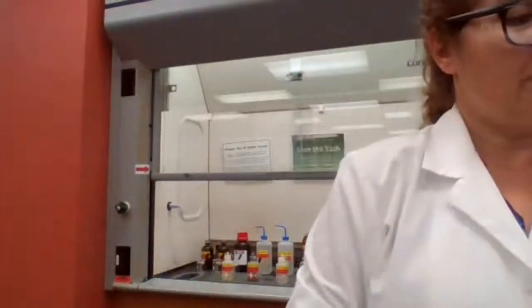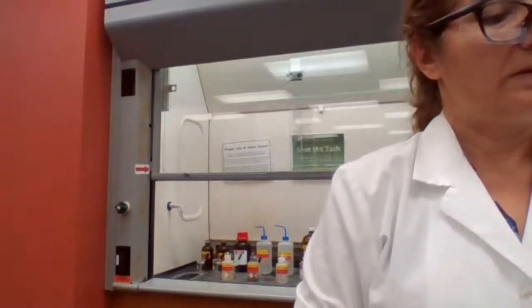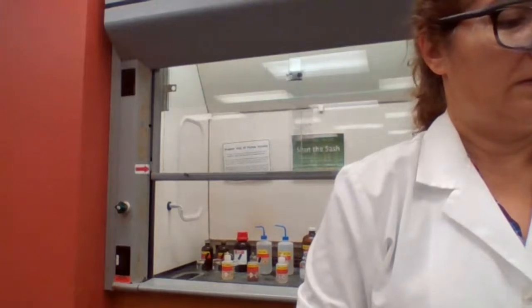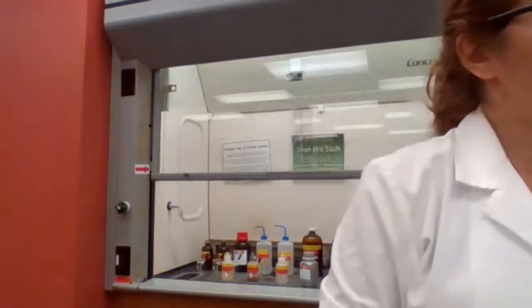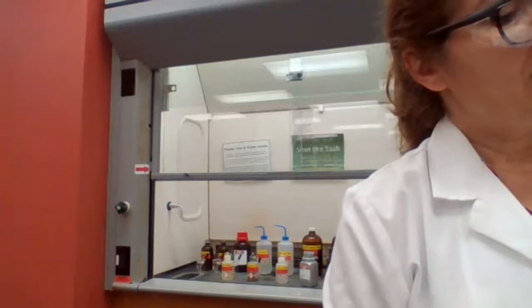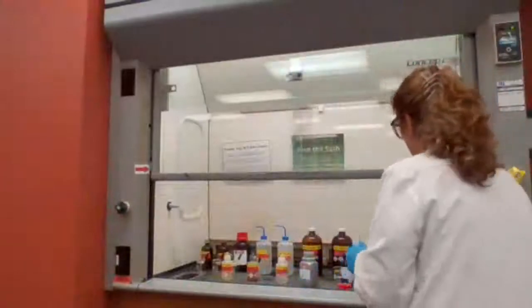After the solubility, we test with silver nitrate. With the silver nitrate test, what's the procedure? A small sample of the acid, and we are going to add ethanol to dissolve. So we take a small sample of benzoic acid.